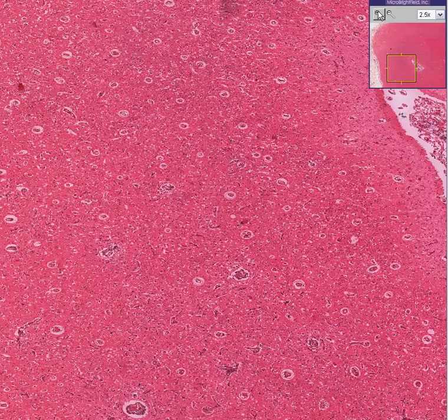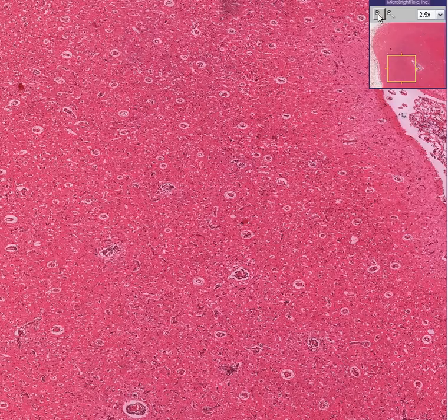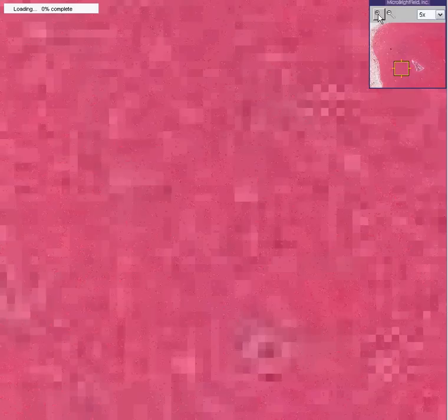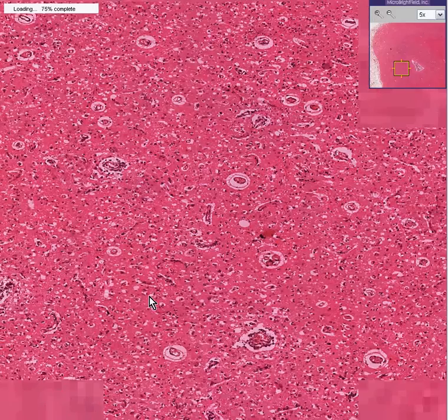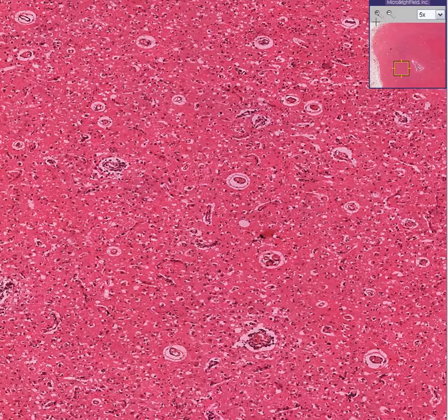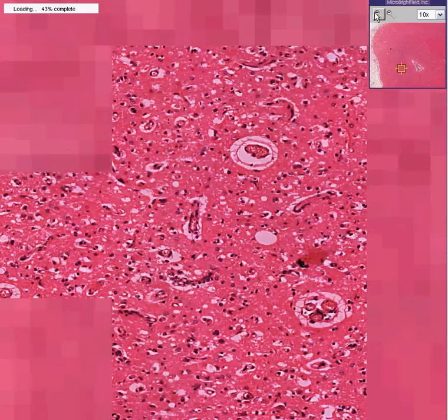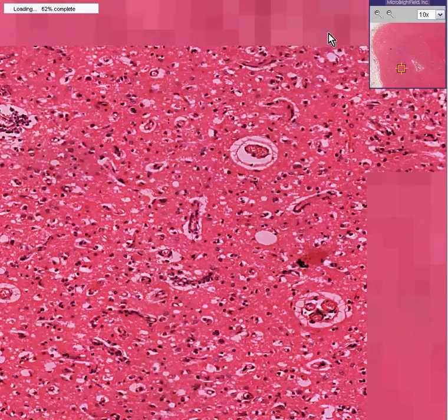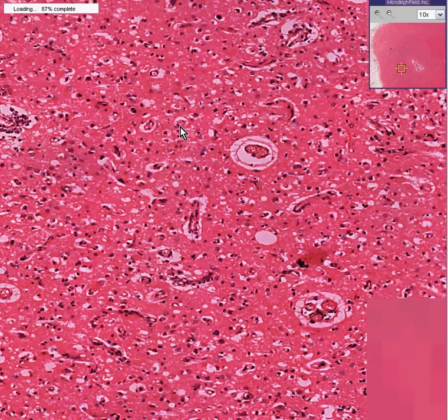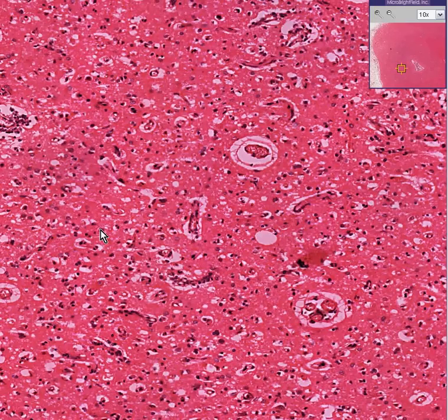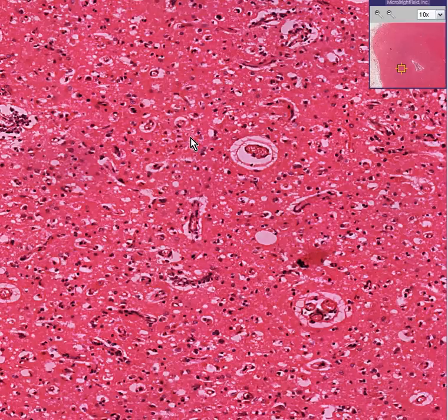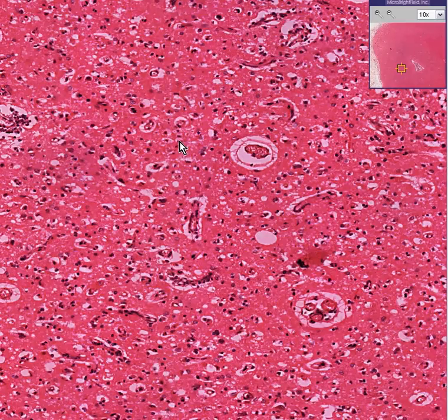The first thing you could notice is that, for some reason, the blood vessels stand out very nicely. Another thing that you could notice is that there appears to be, in general, an increase in the glial cells. So we have gliosis.